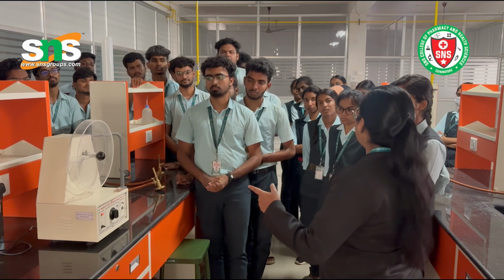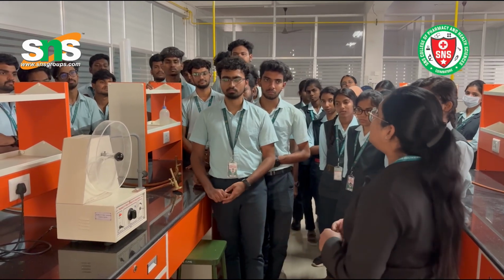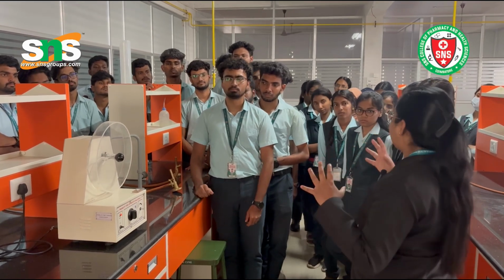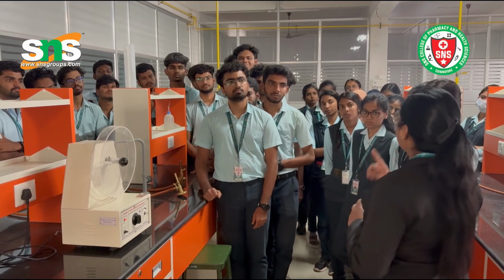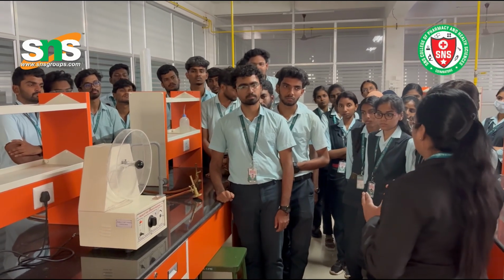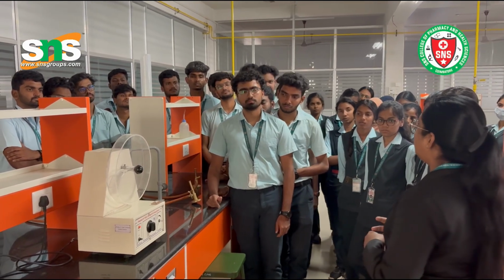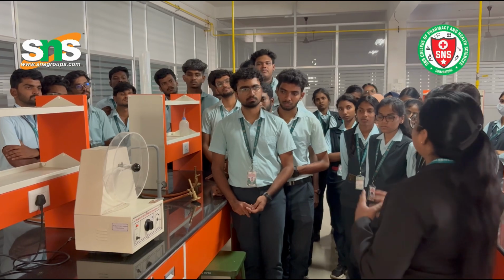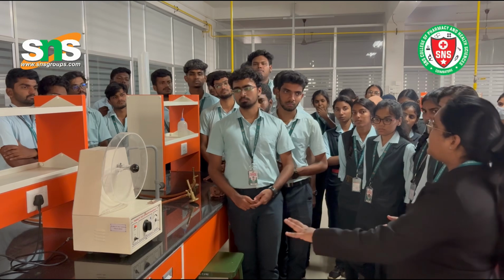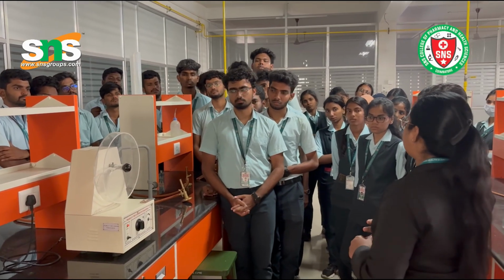So here, this is the friability test apparatus, and this is exclusively a single drum. In industries we have many drums, because in industries we won't work with only a single batch of tablets. We work with a lot of tablets. If we work on only a single drum of the machine, the work doesn't complete. That's why they work on multiple drums. But here in our college we have this single drum.